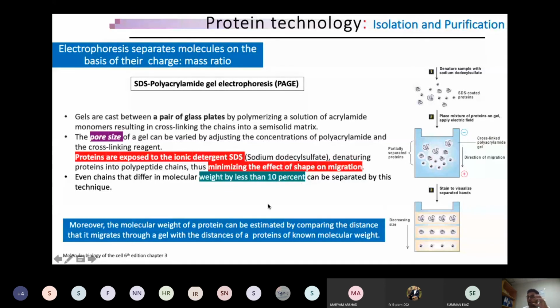And if you have a pore size of 100 micrometer, what does that mean? So you have all proteins down there. Nothing is up there, nothing in the center. So what does that mean? It's a very important thing which you need to understand, that you have to decide the pore size very intently.